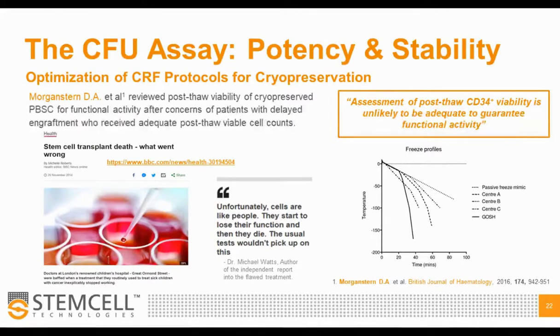The CD34 viability looked great, but when he compared the CFU-GM or CFU output from these different freezing profiles, the data showed that all of them were fine except the one from the Gosh rate-controlled freezer, where that steep curve in the freezer profile was observed. There was actually no growth of the CFU in those samples, whereas the CD34 showed some decent viability.